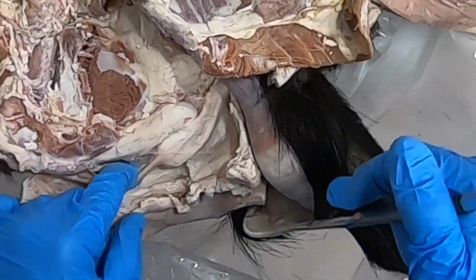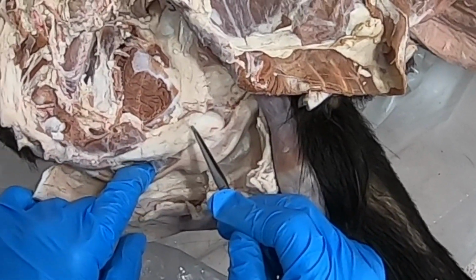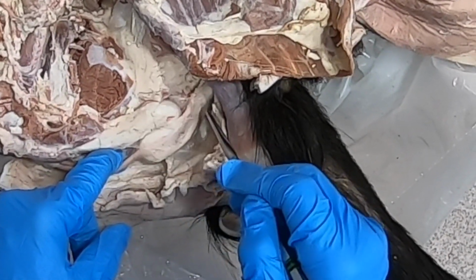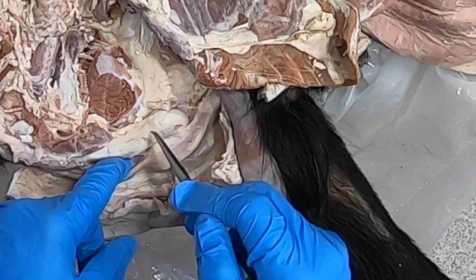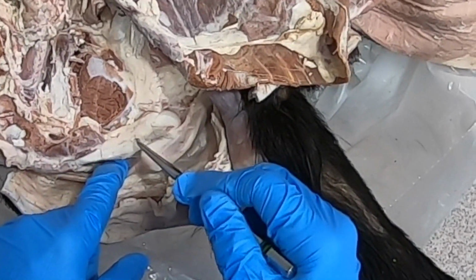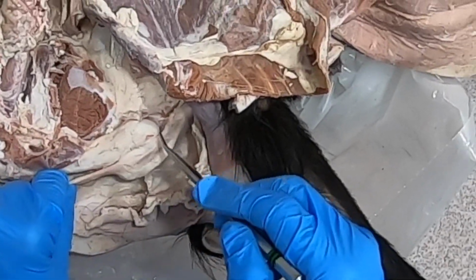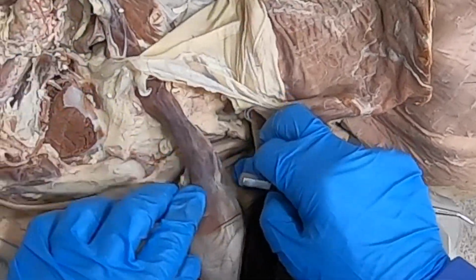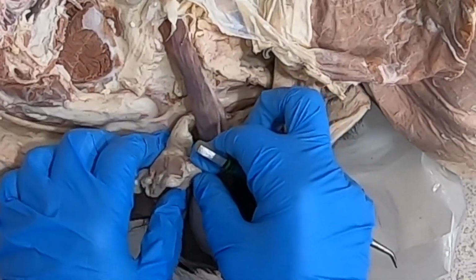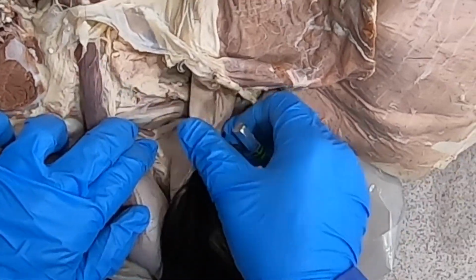So here I've cleaned up so we can see that sigmoid flexure of the penis very nicely. Okay, so these guys have fibroelastic penises. It's true of ruminants as well as the boar. And so because there's a lot of fibrous tissue in there, they don't expand with blood engorgement, but they stretch out. Okay, and this guy just kind of pulls it back in. And so as we come along here, we're going to have right in this area here a lymph node. That's going to be the superficial inguinal lymph node.